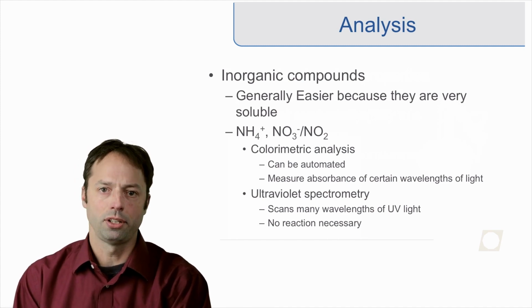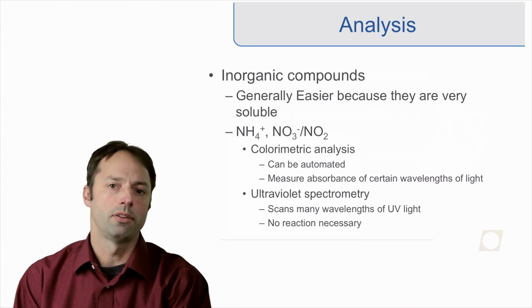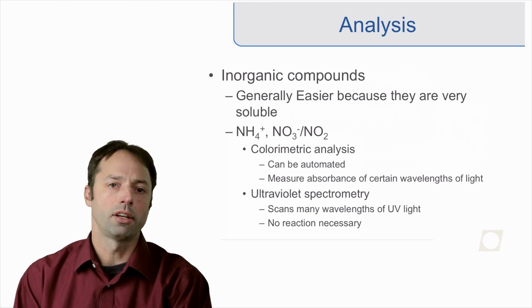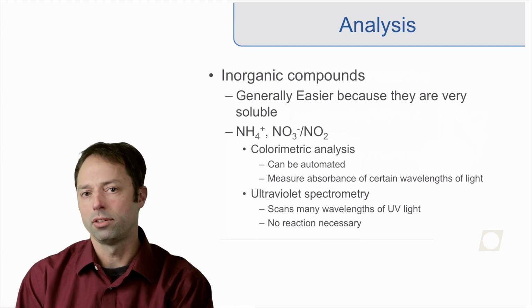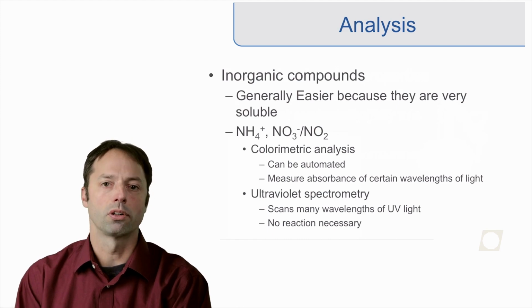Ultraviolet spectrometry is becoming more and more common. You scan many wavelengths of UV light, and the nice thing about ultraviolet spectrometry is there's generally no reaction necessary. There's not a whole lot of sample prep, and field portable devices like this are becoming more and more common.